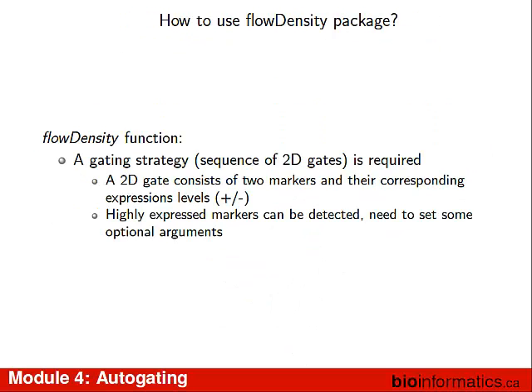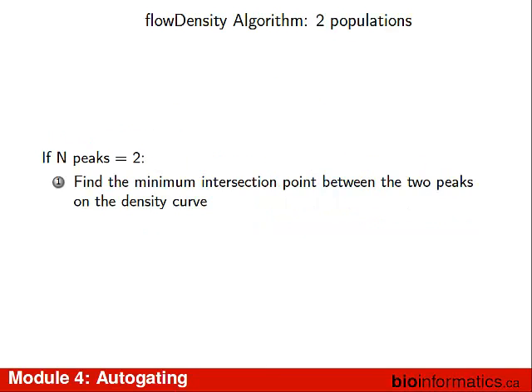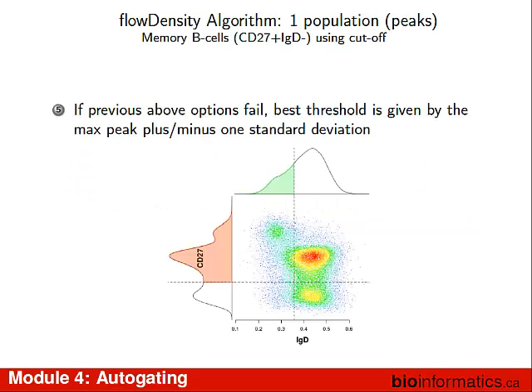Is there a way to get a measurable modality within a particular parameter? Like, say, there are three modes here, or two, in this case, say CD27. Is there an algorithm that can look at that? And maybe compare it to other distributions in the data?